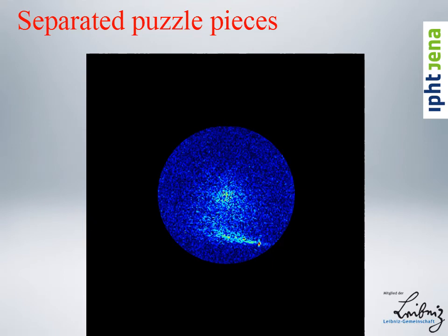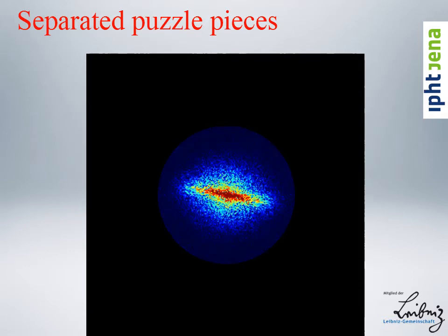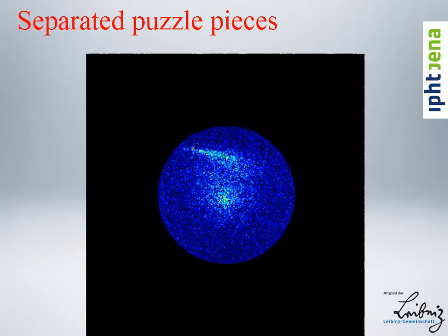So this is the Fourier transform of one of these extracted 5 components. And this is the plus second component. This is the plus first component. This is the extracted 0 component, minus first, minus second component.